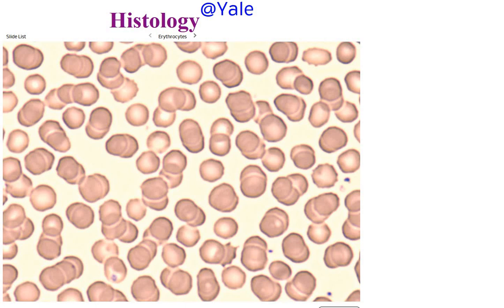And because it's mostly water, it is very transparent. It's allowing a lot of light in from the microscope, and so that's why it looks really clear. Basically, we're just looking at the space between red blood cells to find that plasma. There are a couple other components, things like albumin and globulins that we aren't going to see on a slide. So just keep in mind, everything in the background here is going to be plasma. So that's the fluid component of blood.